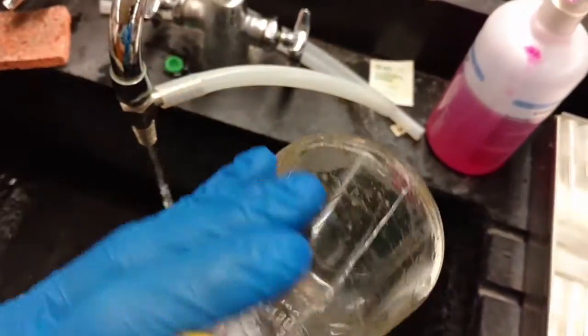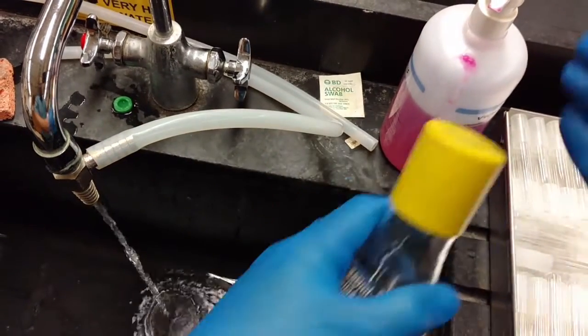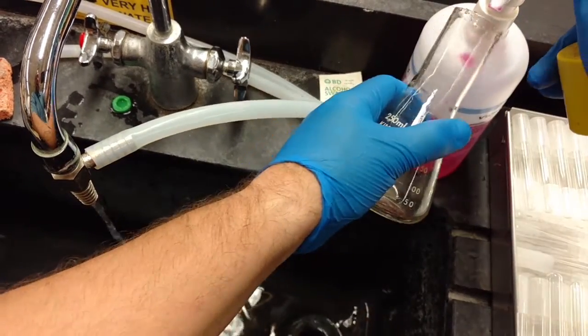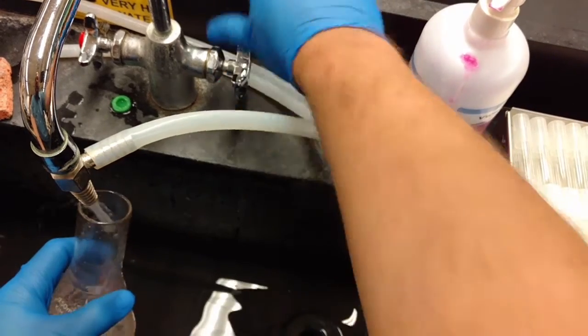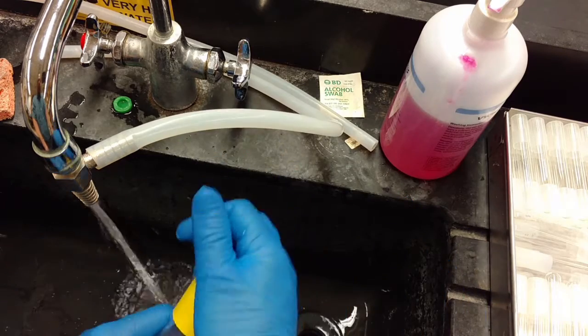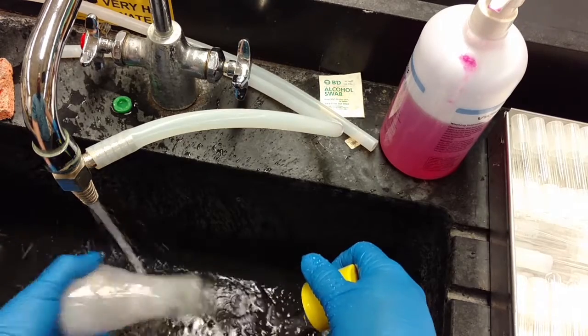If you succeed in getting all or almost all of the solids out, then you're in good shape. You can go ahead and clean the flask with soap and water — add some soap, add some water, shake it well.